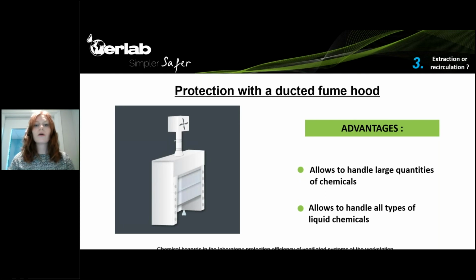So the main advantages of a ducted fume hood are that it allows you to handle large quantities of chemicals, as well as all types of liquid chemicals.